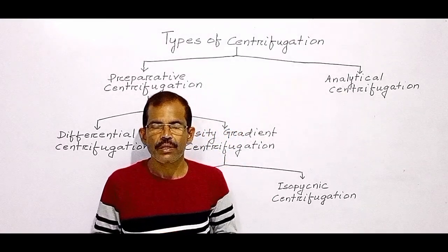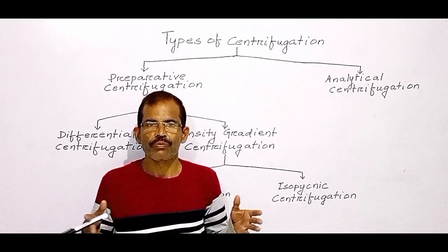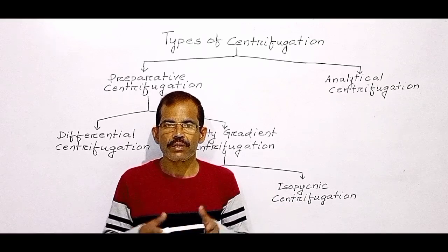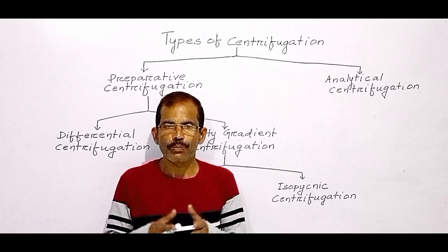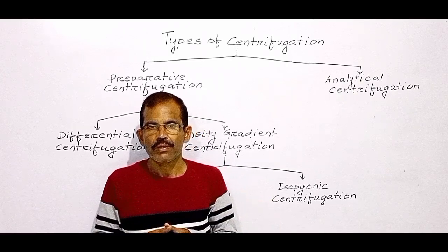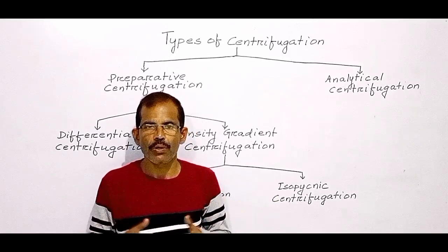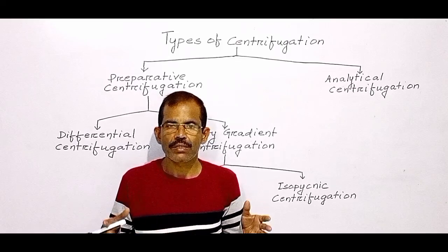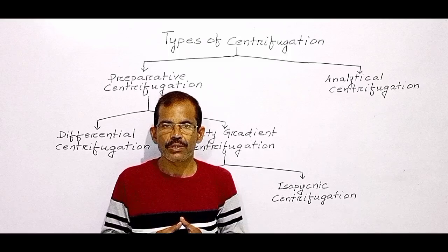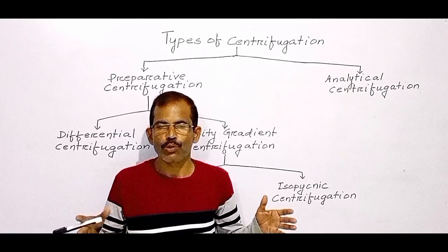Centrifugation is a mechanical process that uses centrifugal force to isolate and purify components such as tissue, cells, subcellular structures, membrane vesicles and biomolecules. This technique is also used to characterize purified macromolecules with respect to their sedimentation rate, relative molecular weight, concentration, purity, and to study conformational changes in proteins.